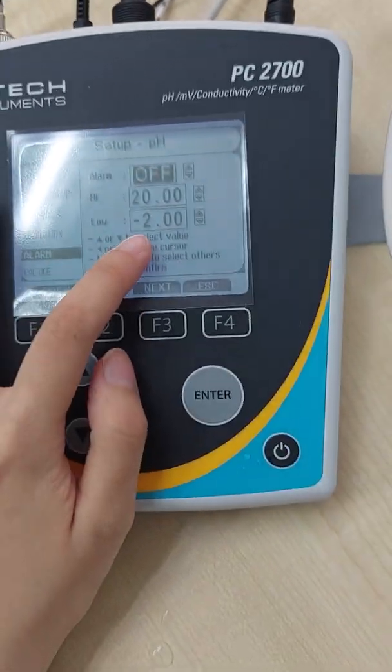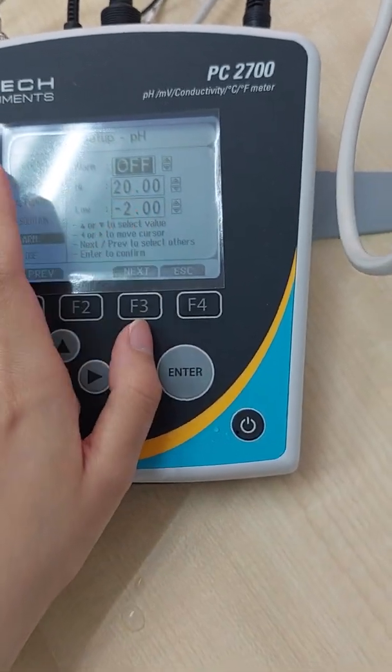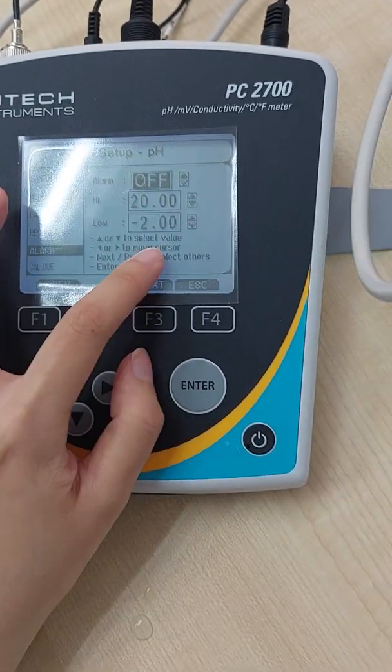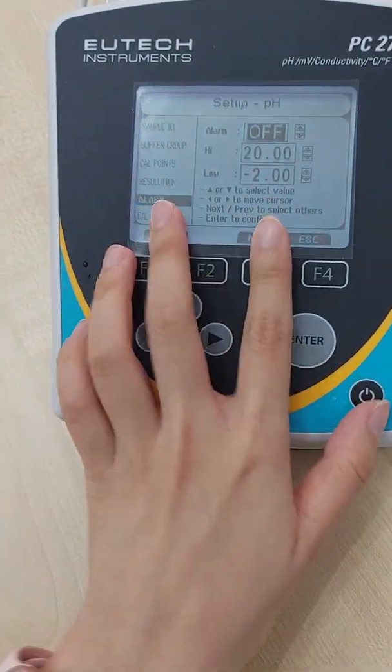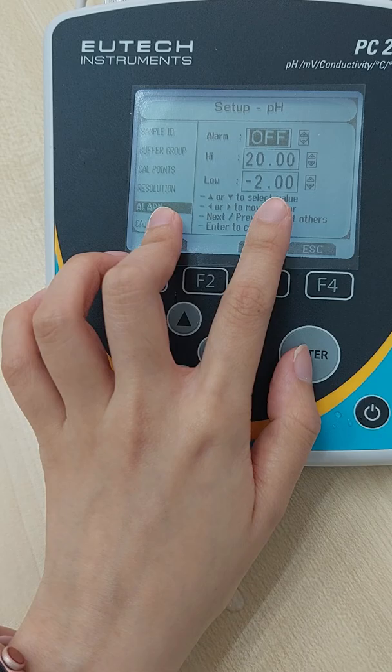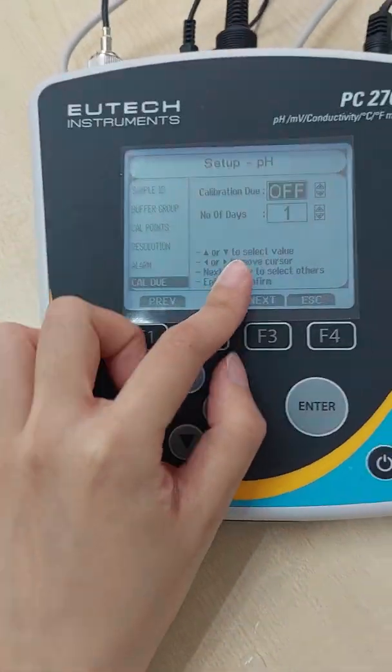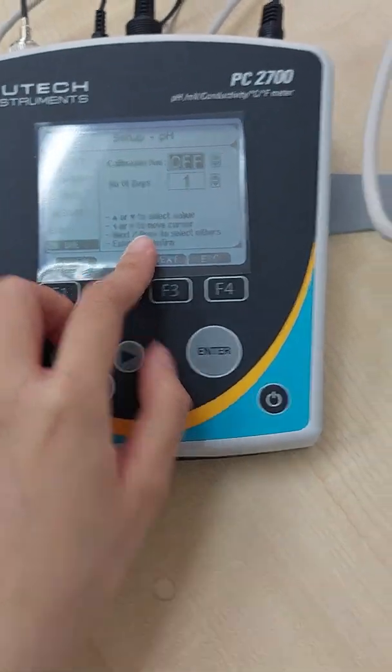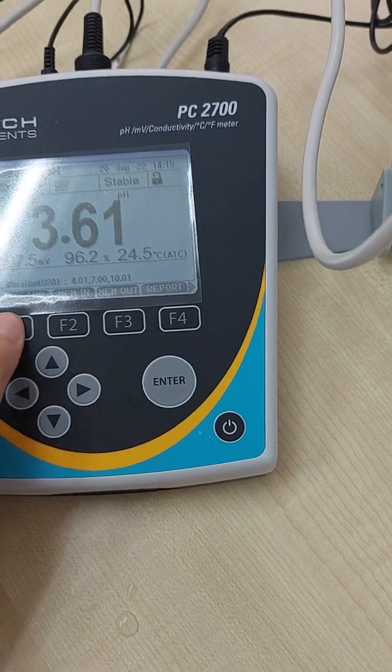Alarm, you can set your range. Let's say your acceptable range is pH 10 and also pH 5. So if your measurement is out of this range, it will have an alarm to remind you. Cal due is just a calibration reminder for you.